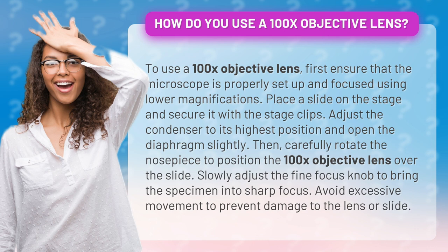Place a slide on the stage and secure it with the stage clips. Adjust the condenser to its highest position and open the diaphragm slightly. Then, carefully rotate the nosepiece to position the 100x objective lens over the slide.